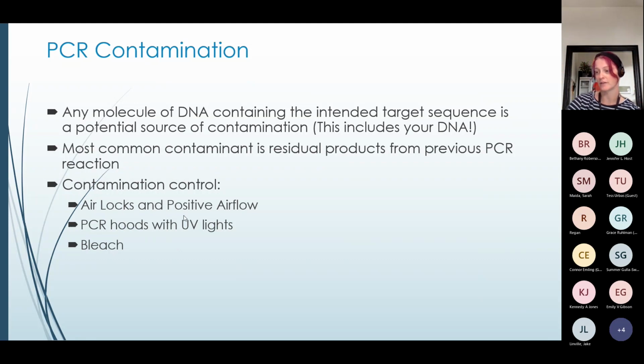Contamination controls: we have airlocks and positive airflow. We have PCR hoods with UV lights, and we use a lot of bleach. We make it daily. We have separate rooms for each setup technique, and when you rotate through molecular, they'll talk about all that.